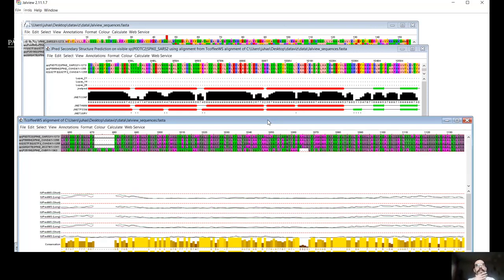So these are all calculations, beyond visualization, but these visualization tools can help us to understand not only the sequences, but the group of sequences. You can do this kind of visualization for independent sequences as well, but if you do it for a multiple alignment, you can inspect and catch more general patterns than by viewing individual sequences.